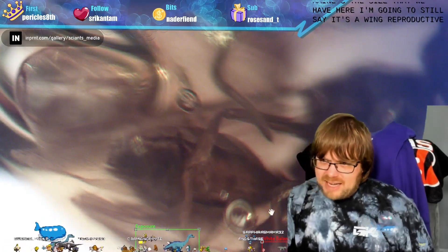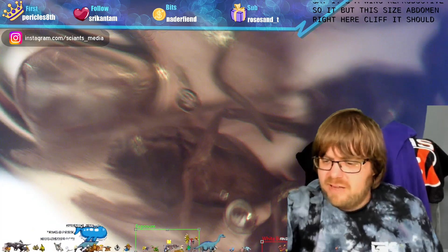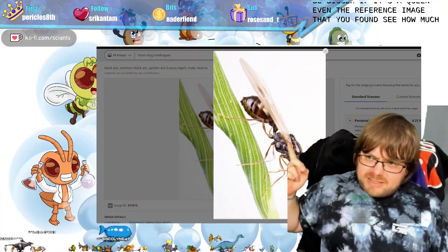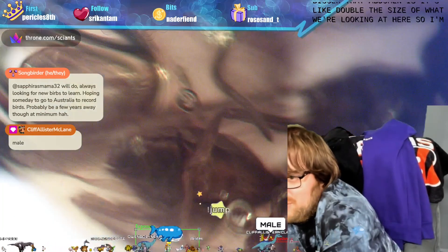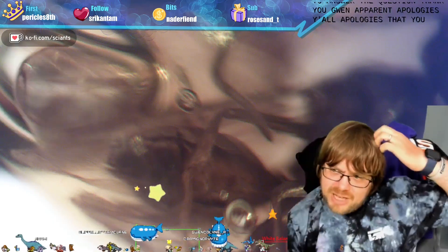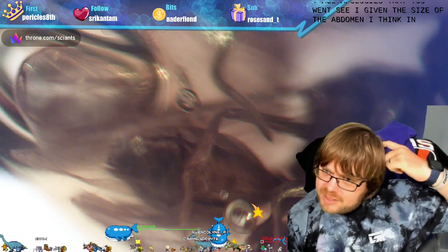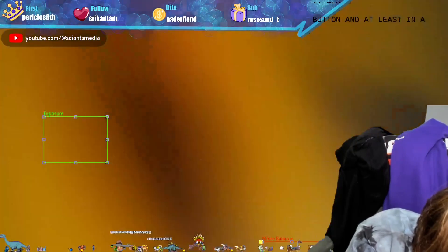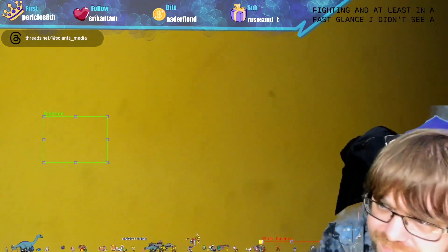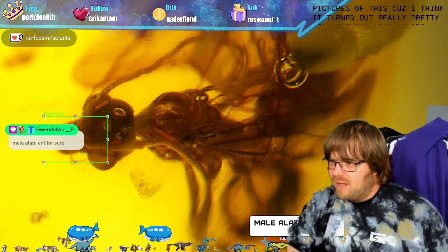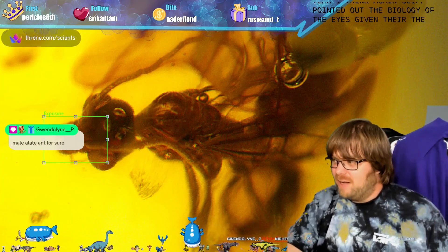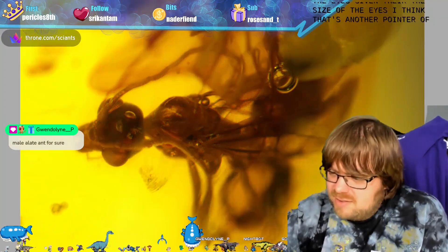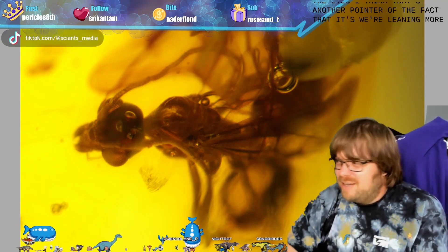This abdomen size should be bigger if it's a queen - even in the reference image you can see how much bigger that abdomen is, like double the size of what we're looking at here. I'm leaning towards this being a male just because of that size. Given the size of the abdomen, I think this is a male rather than a queen. Cliff also pointed out the biology of the eyes - the size of the eyes is another pointer suggesting we're leaning more towards a male, especially with the abdomen not being large.